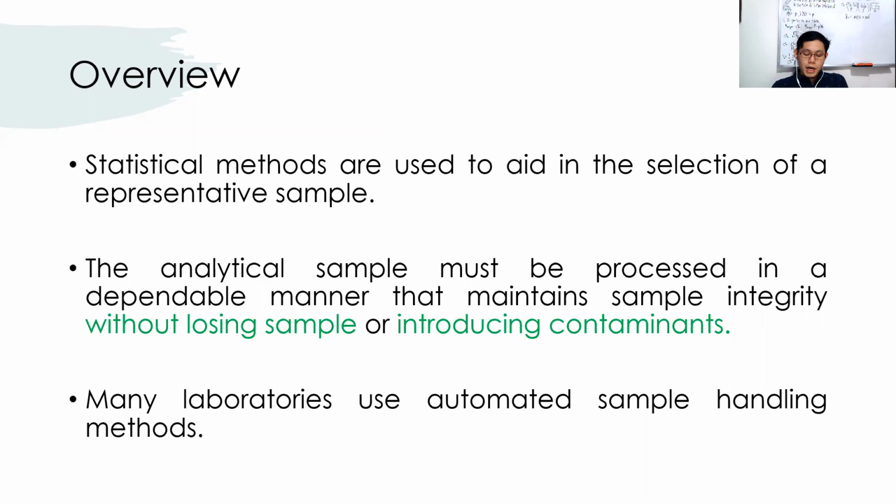So, pag HPLC mo, meron ka nang automatic sampler which collects the sample from your vial, and then dispenses a specific volume, which is the same across the board.